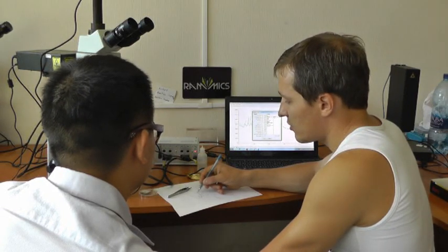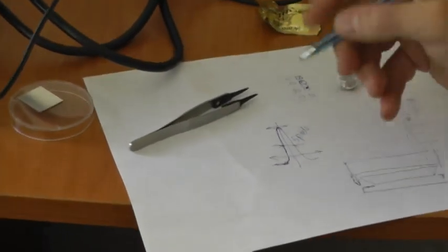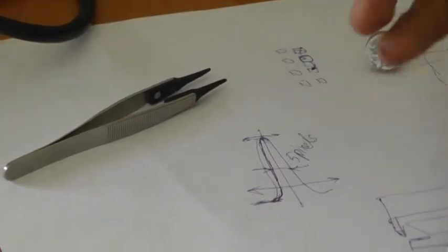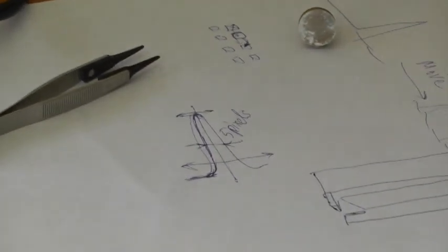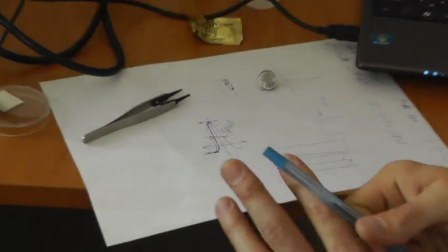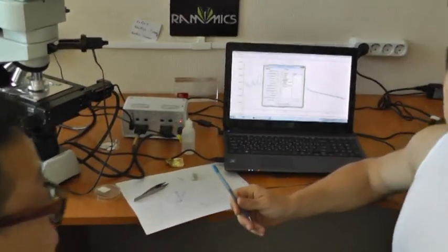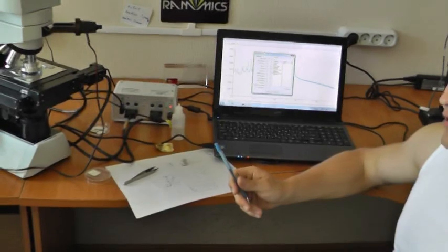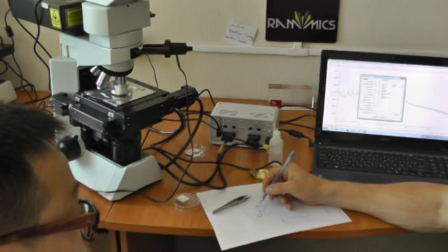And this peak position can still be shifted from its actual value, because the laser is too strong, and when it enters the Raman analyzer, it can be distorted somehow, and it can be shifted on the CCD surface.